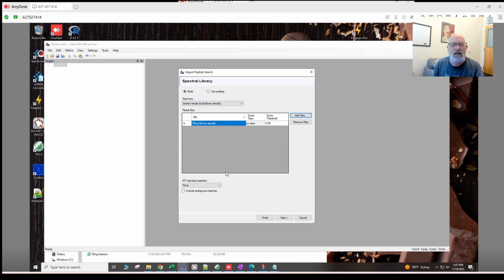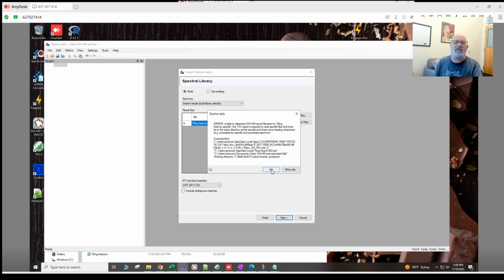So let's see. Okay, so remember to put CIRT. That's very important. I've never experimented with include ambiguous matches. You may want to do that. And then we're going to hit build and we're going to hit next. And I predict we are not going to get an error. So let's see. Oh, we did. Oh my God, what's wrong?